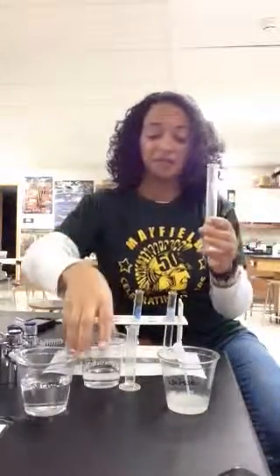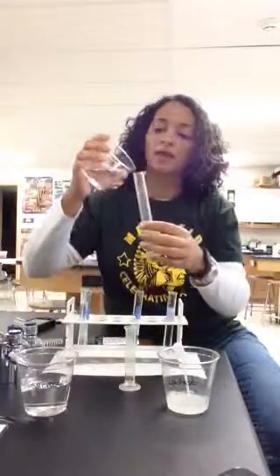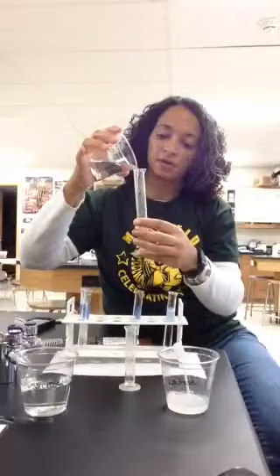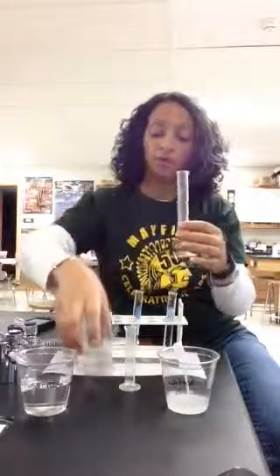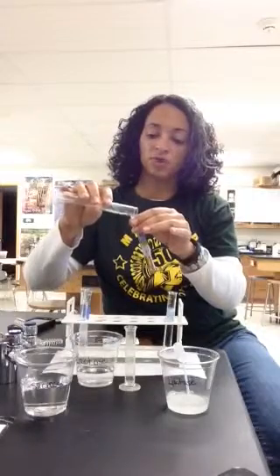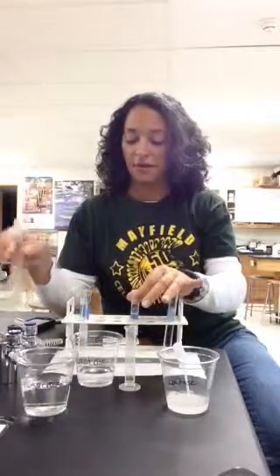I need to repeat this because I need to have a control. Okay, so I'm going to fill it back up to 10 milliliters. I'm going to pour it in my second test tube. So one of these test tubes we're going to put lactase in. The other test tube we're going to not put lactase in. So that one without lactase is going to be our control for this experiment.